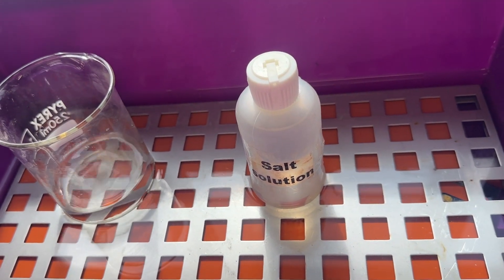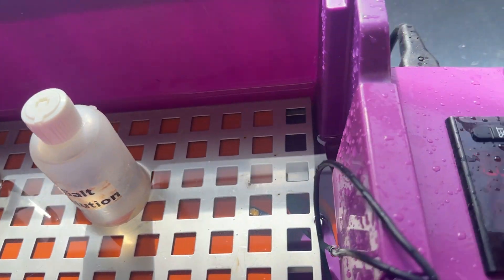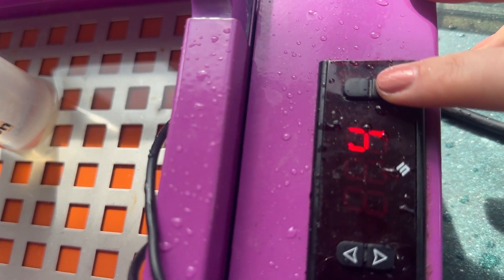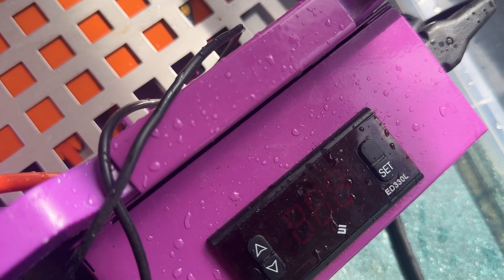You can put beakers in here, bottles, you can even put test tube racks with test tubes or boiling tubes. You set the temperature to the exact temperature that you require and then you leave this to heat.